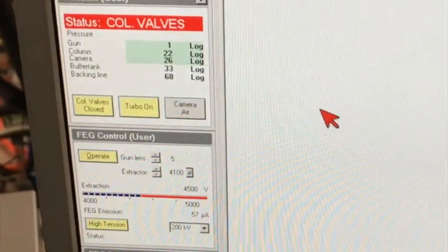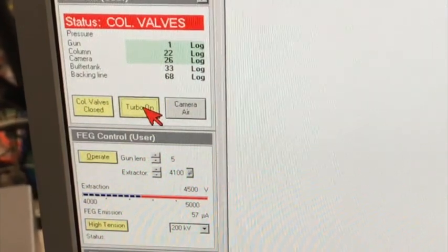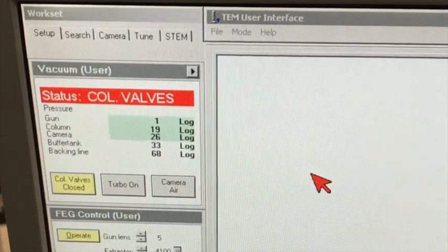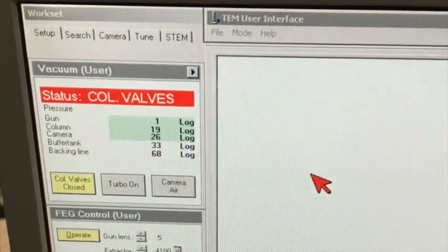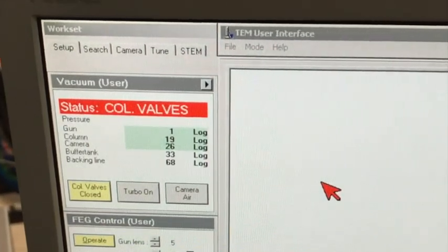After fully inserting the specimen holder, we can turn the turbo off. The vacuum of the column should be below 15 before we open the gun valve. Right now, this is 19. While we are waiting for the vacuum, let's have a quick look at the instrument.